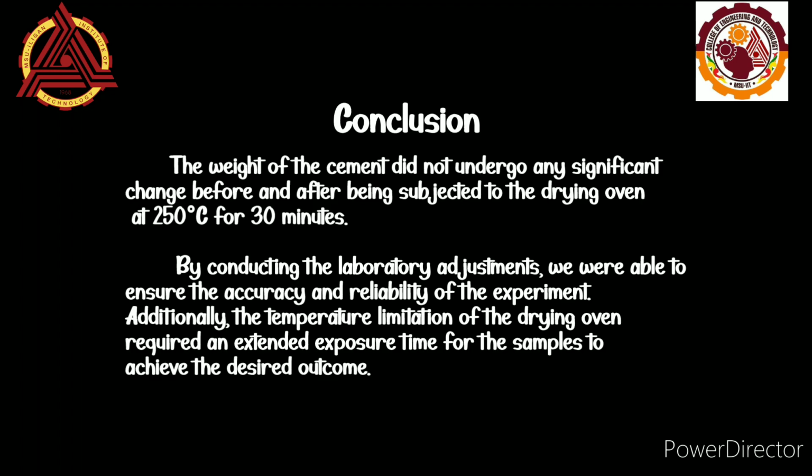In conclusion, the weight of the cement did not undergo any significant change before and after being subjected to the drying oven at 250 degrees Celsius for approximately 30 minutes. This observation suggests that the cement is fresh and devoid of any moisture content. By conducting these laboratory adjustments, we were able to ensure the accuracy and reliability of the experiment.